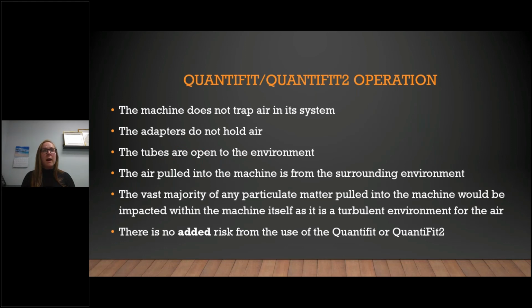So these are the top responses to the concerns that our customers have brought to us. And some of them aren't on here. One that we've been getting more frequently is just clarification that your barrier facial covering is not a respirator, and it cannot be fit tested. It should not be fit tested because the fit test would not be very effective because of how barrier facial coverings work. They're primarily meant to be a method of source control, right? They're not primarily acting as any sort of personal protective equipment, although I don't want to get into the weeds about all that. But these are the top responses to some of the concerns that our customers have brought to us, specifically to me.